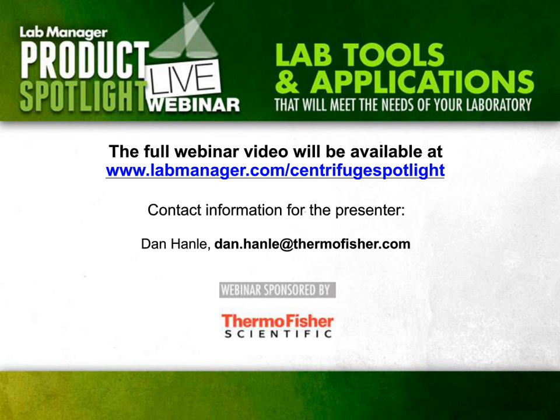Great, thank you. Now, you mentioned those auto locks and biocontainment lids and that sort of thing, which are sort of ease of use features. How do those impact safety in the centrifuge, apart from people actually using them rather than keeping them in drawers? Yeah, right.